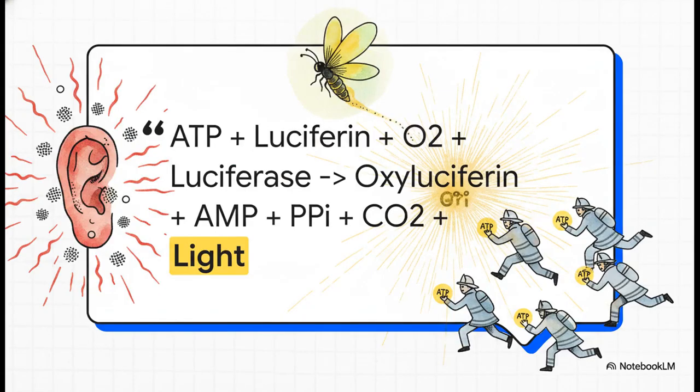Now, take a look at the chemical equation that actually makes this whole 442A guideline tick. Basically, sensitizers induce the proliferation or multiplication of lymphocytes. More living cells means more adenosine triphosphate, or ATP. We use an enzyme from fireflies called luciferase to react with all that ATP.